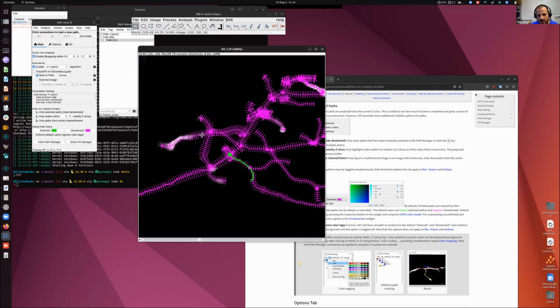So right now, I'm moving the cursor, and you see that at the bottom, we are navigating in the Z plane, and the program is looking for the brightest location in that column in the stack. We call this signal sniffing. We find it to be very useful. This ensures that you always are in focus when you are trying to trace a neuron. There are other options, but that's pretty much one of the most common.